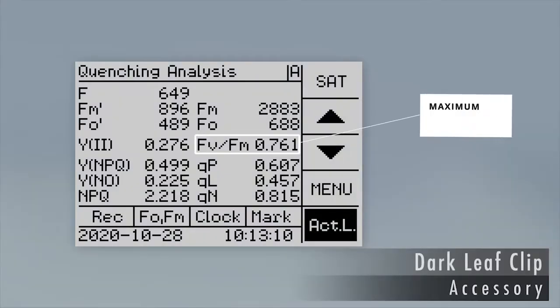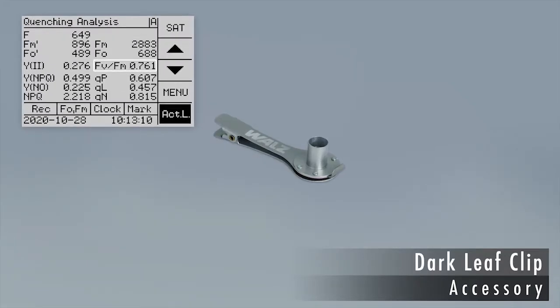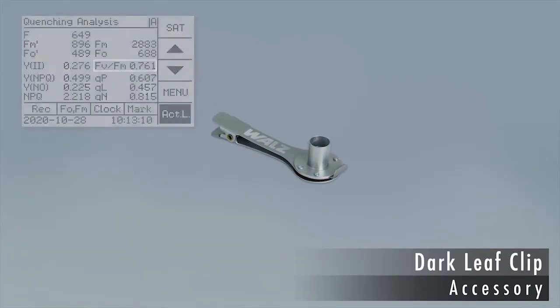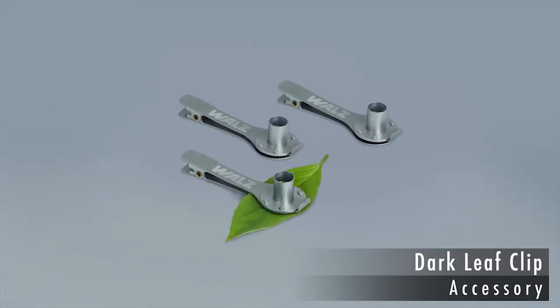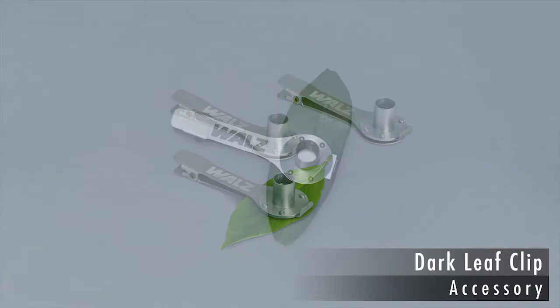The maximum quantum yield of Photosystem II, the FV/FM parameter, responds with sensitivity to many stress factors. Measuring FV/FM requires dark acclimation. For this purpose, Waltz has developed a dark leaf clip.